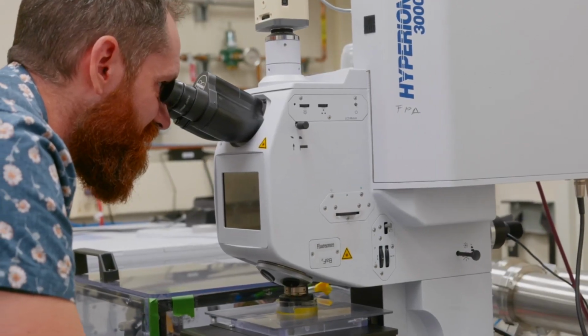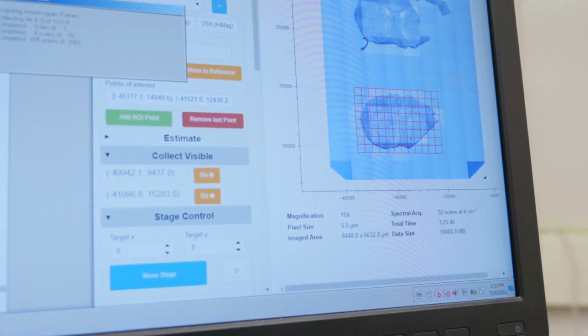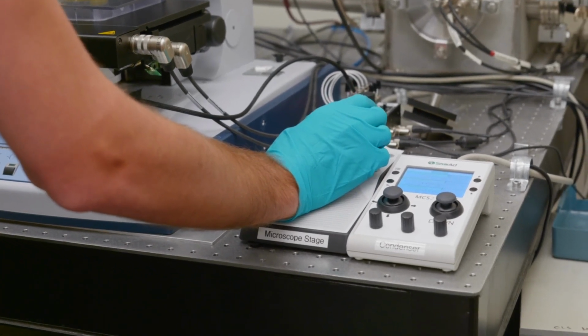So we've developed a collaboration with other synchrotrons around the world in ways to help workflows and make data analysis less challenging. In addition, we're developing new kinds of microscopes. So we have a horizontal attenuated total reflectance microscope that allows us to do imaging, again, on very complicated samples. This position allows me to couple a lot of my interests together into solving problems.